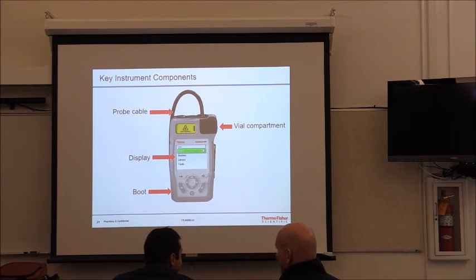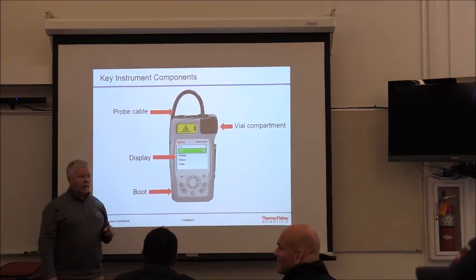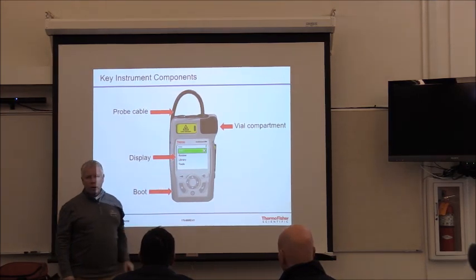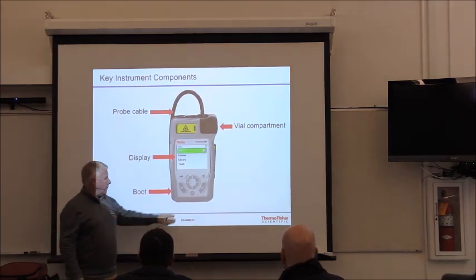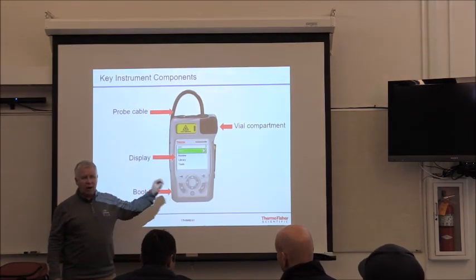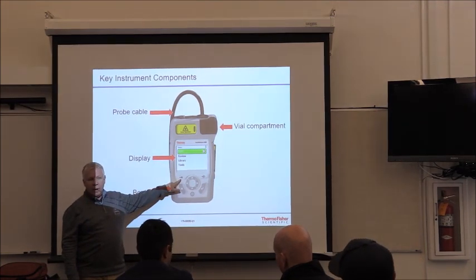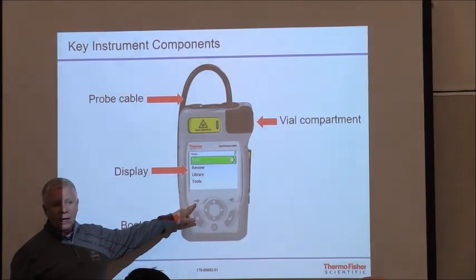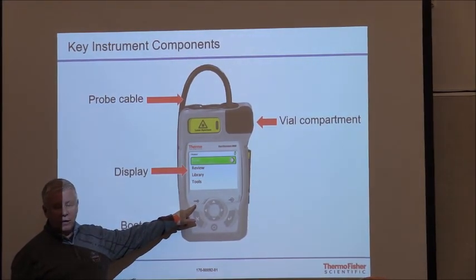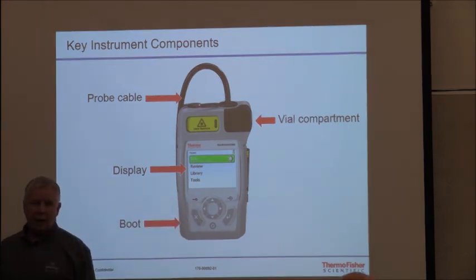This is your device, so when you're running a device, whether you're running the RMX or your FTX, your screens are going to be the same. Your basic buttons on the RMX and the FTX are identical except for this button here. On the RMX, this button is used to turn on or activate the laser. On the FTX, you don't have a laser, so that button is replaced with a flip screen button, so you can rotate the screen 180 up and down.